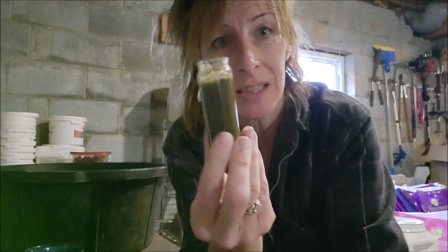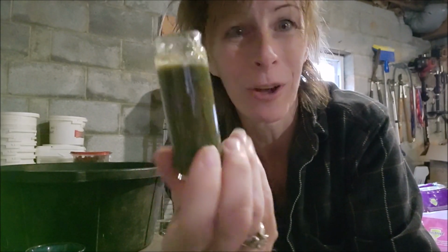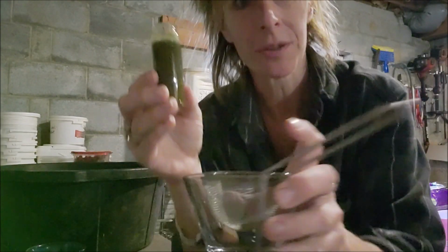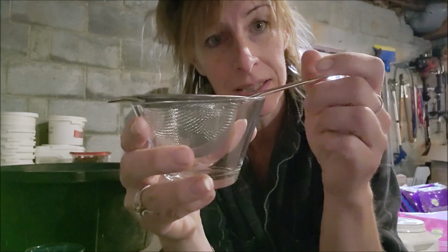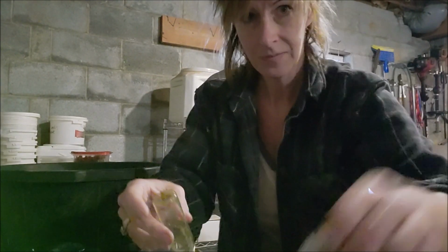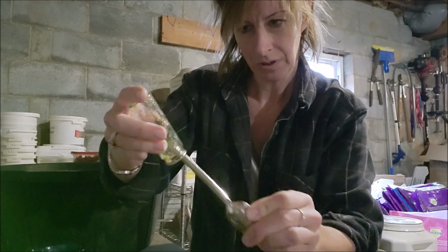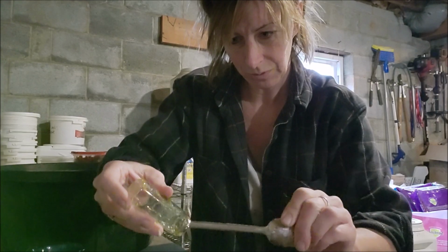All right. I think that's pretty good. What do you think? Looks like that, okay. So all my juicers or health nuts, doesn't this look super familiar? You want to drink that in the morning? No. Okay. So now I also happen to have a tea strainer and a cup. Super easy. And we are going to strain this right in here. So we're just going to pour all this in there. Make sure you get it all in. We're going to let this sit for a minute. So let me scrape it all down and put that right where it belongs. Because the more juice we got out of it, the better.